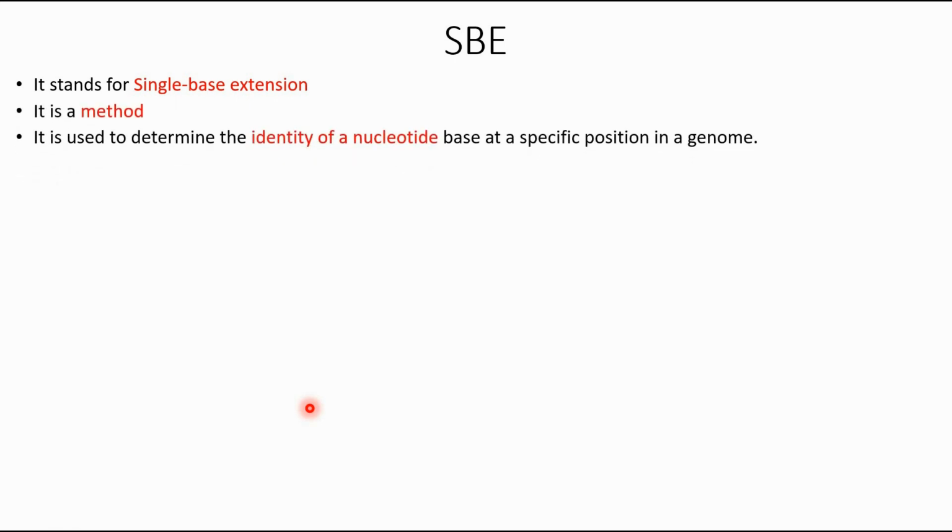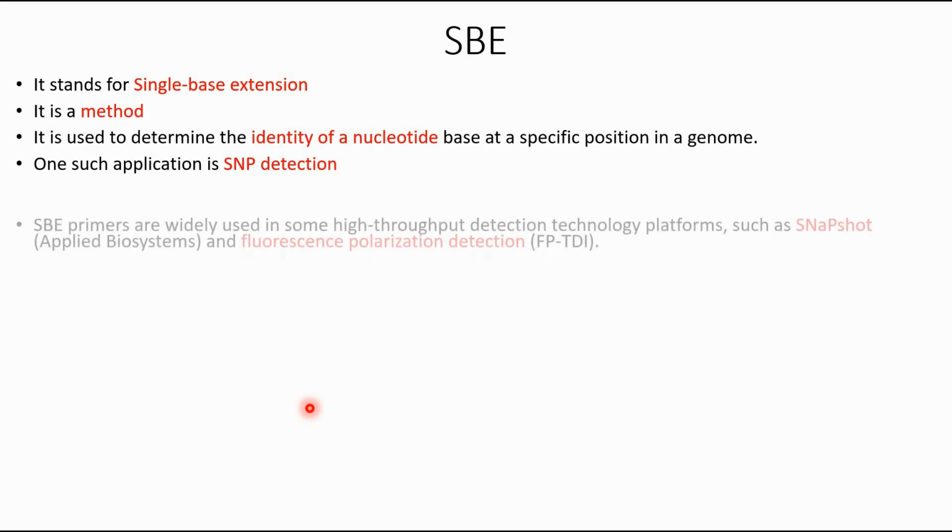Now first let's see what SBE means. It stands for single base extension. It's a method used to determine the identity of a nucleotide base at a specific position in a genome. One such application is SNP detection.